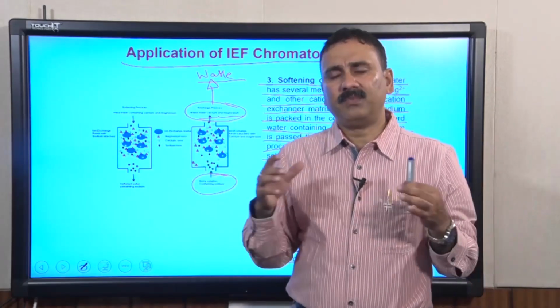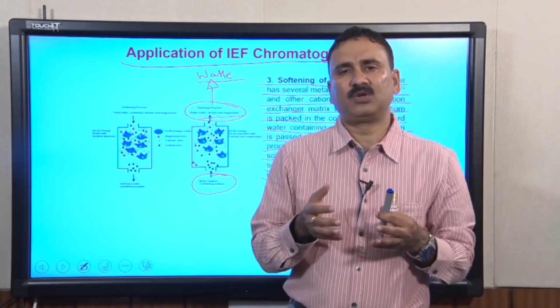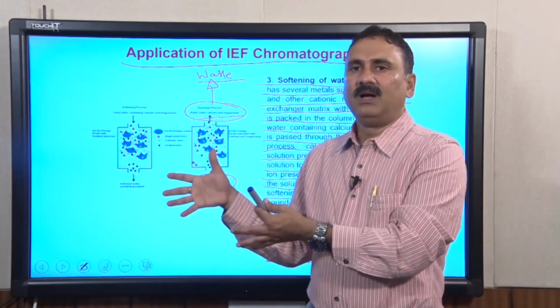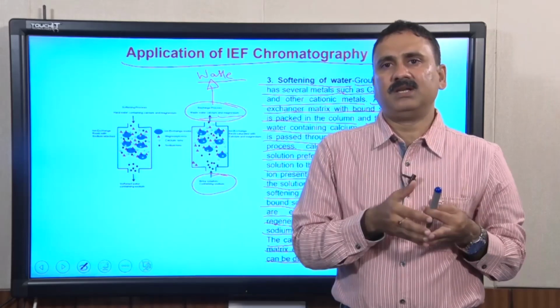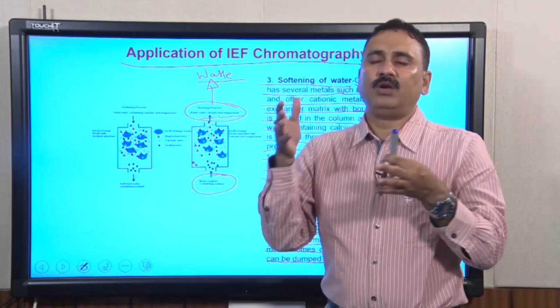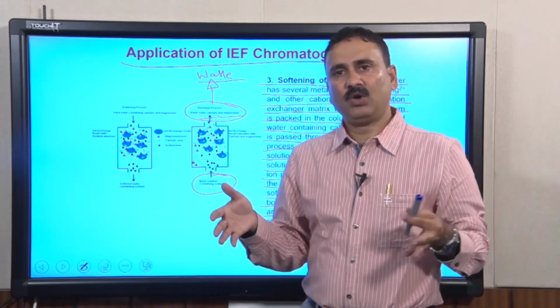So, very briefly, we will discuss the application of ion exchange chromatography in protein purification as well as other applications, so that you can use ion exchange chromatography for developing different types of assays, or for studying the interaction between biomolecules.